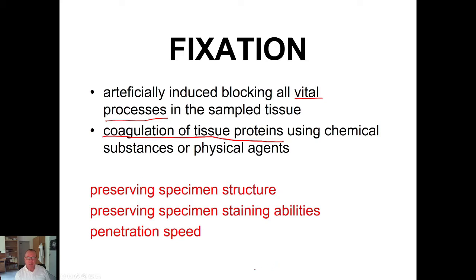It's so-called autolytic, I think I can write this word, autolysis. Autolysis is a process of the enzymatic changes of tissue after its death, and it starts immediately after the decrease of oxygen levels in the tissue, and it goes on up to the moment when we fix the tissue.